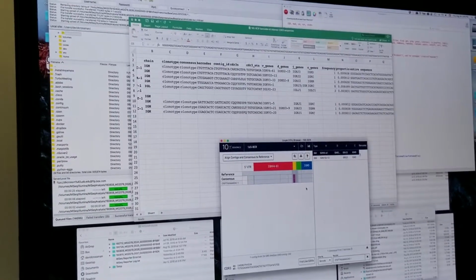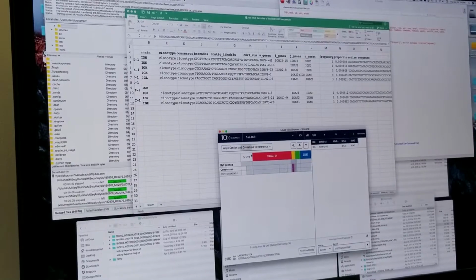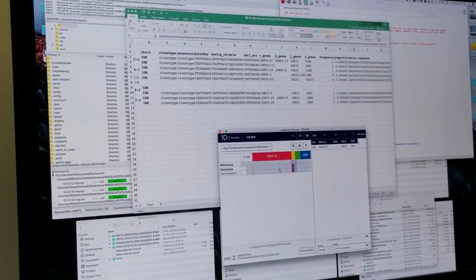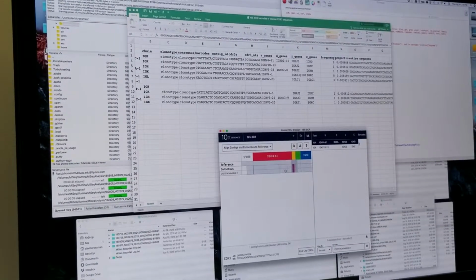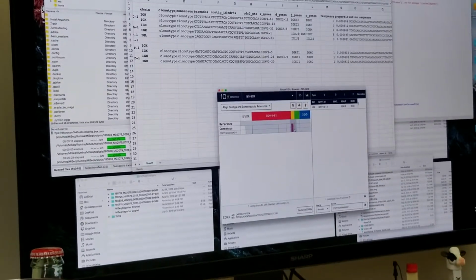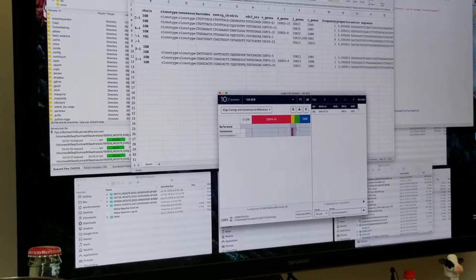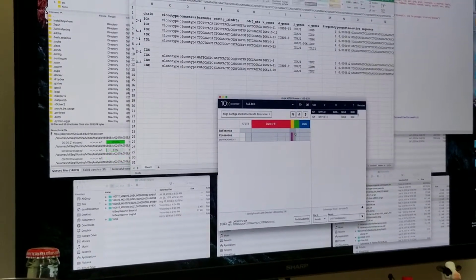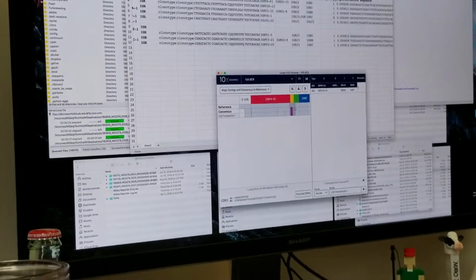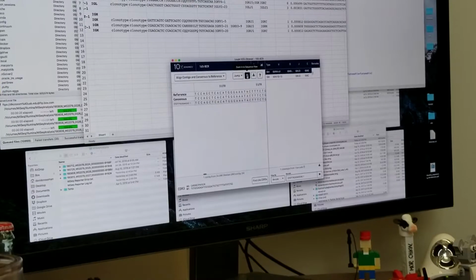All right, okay. So again, you've got your start here. You have your 5' UTR. Looks like a couple of mismatched bases here. Deletion of 18 bases, some mismatches, and again I don't see any sort of stop introduced at the moment. Well, that's good. There shouldn't be a stop. We hope not. Is there a way to tell?